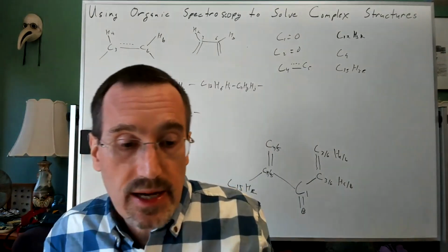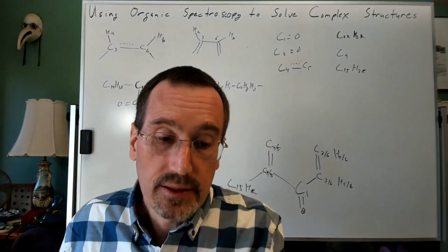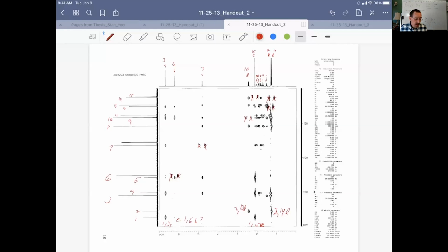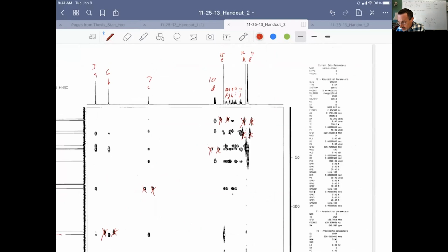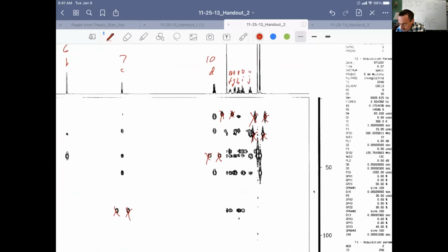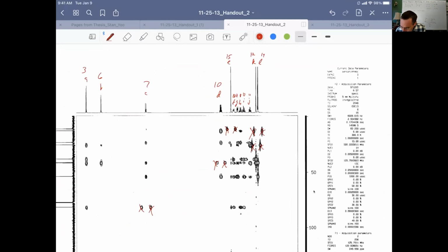And so I'm going to come over at this point to our isolated methyl. I'll come to 12K. And 12K really ends up being a nice linchpin. This is a common feature when you have isolated methyls. So we get 12K with 11.